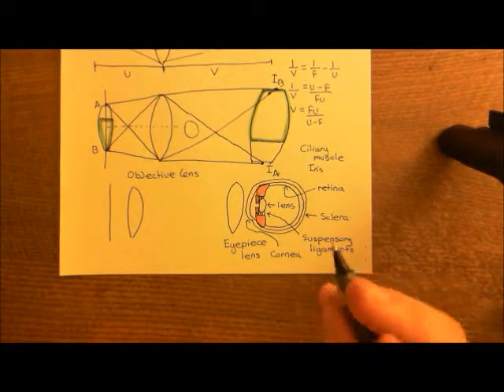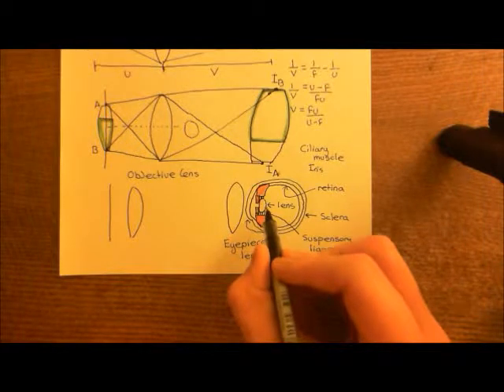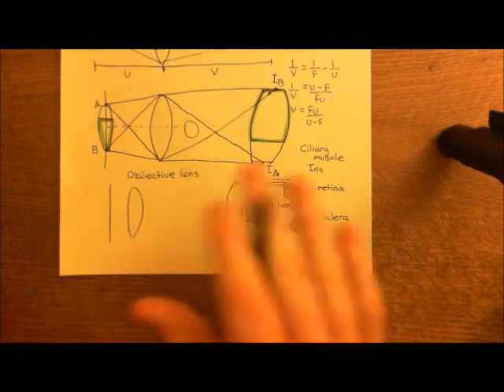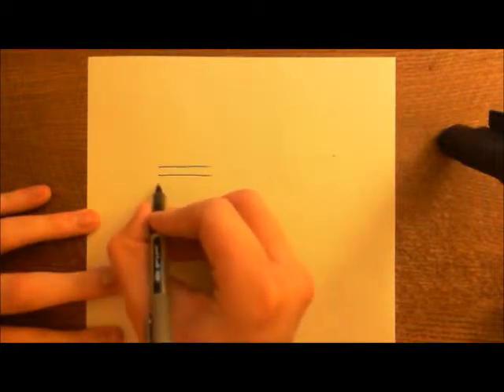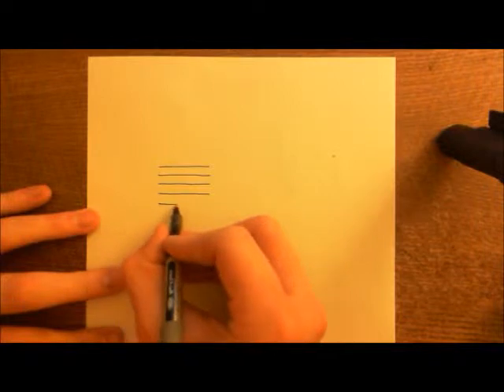Right, so the human eye lens is designed to focus light that is coming from infinity, basically. Let me explain what that means. If you have light that is coming horizontally, i.e. not coming from a point source, so light like so, that can be focused by a lens.